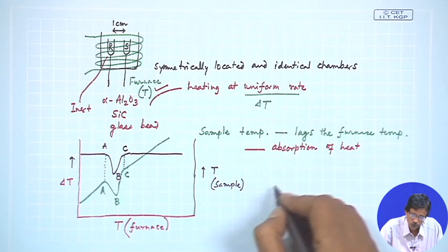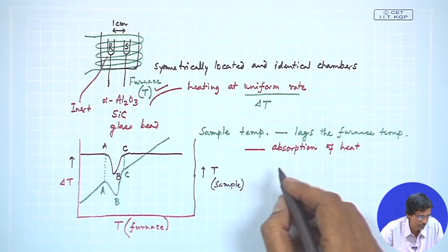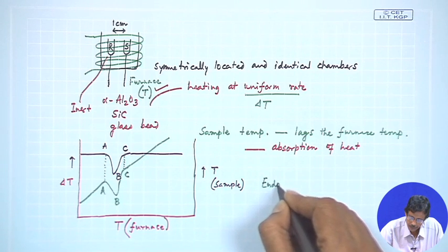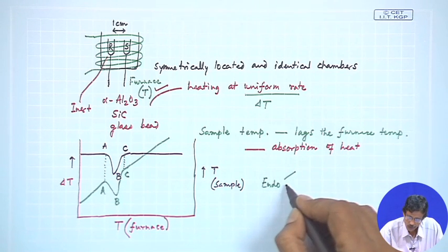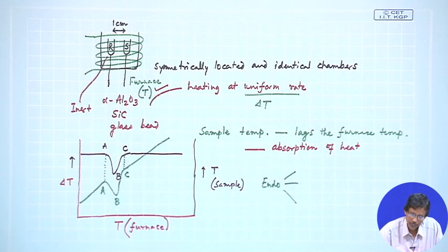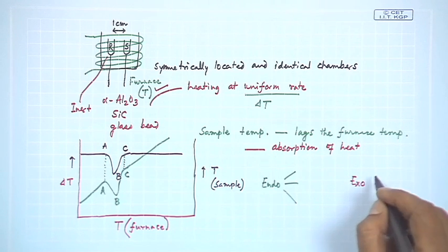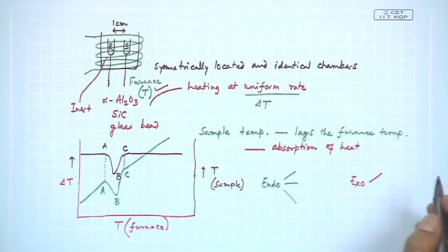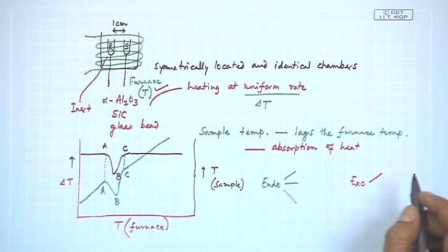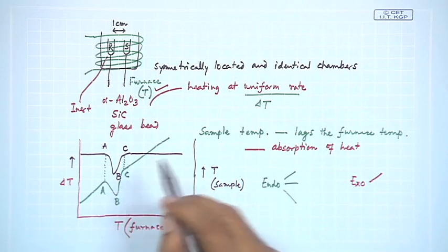So, two processes. When we go for the qualitative analysis, it will tell us that either we have endothermic activity, where samples can show different types of behavior, or we can have exothermic behavior. That we typically try to monitor and examine, and then correlate with the corresponding area of the curve, because this area will quantify the corresponding temperature effect.